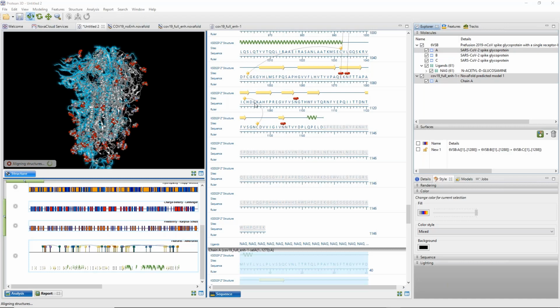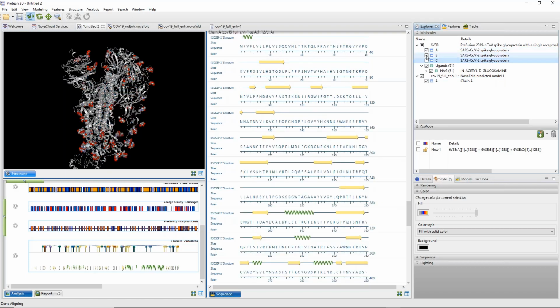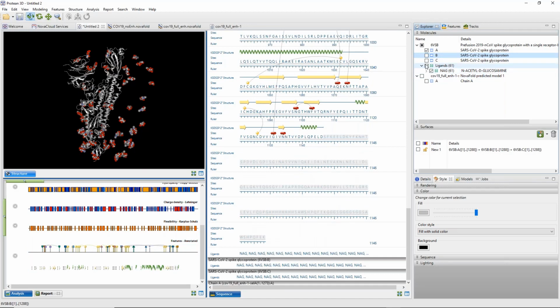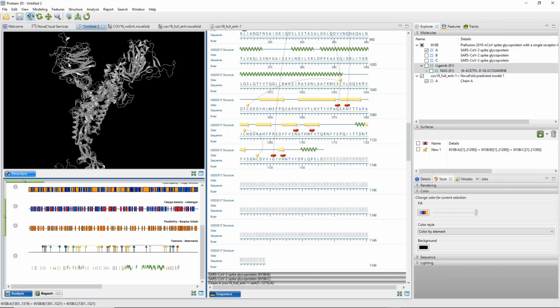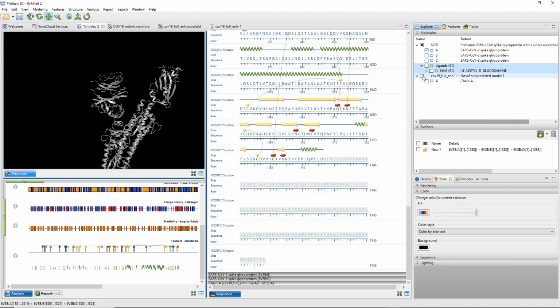And then I want to show you how the surface topology changed. So it just put it into that region, but as you can see, that model that we had initially, I'm going to hide some of this so we can see it a little better. There we go. So it was missing quite a bit of regions. You see that? And the region that I'm mostly concerned about is this one right here. So it was missing quite a bit of structure there. Do you see that? If I turn that on and off.